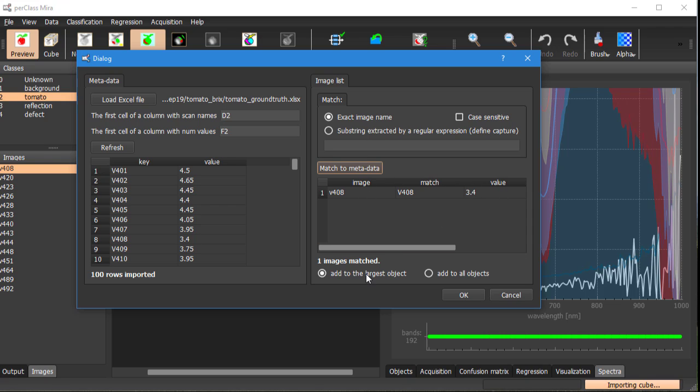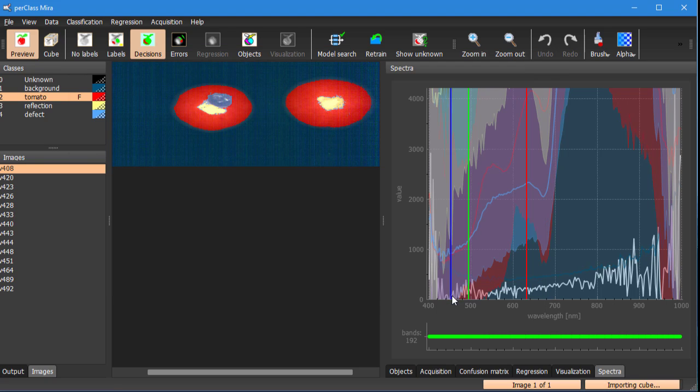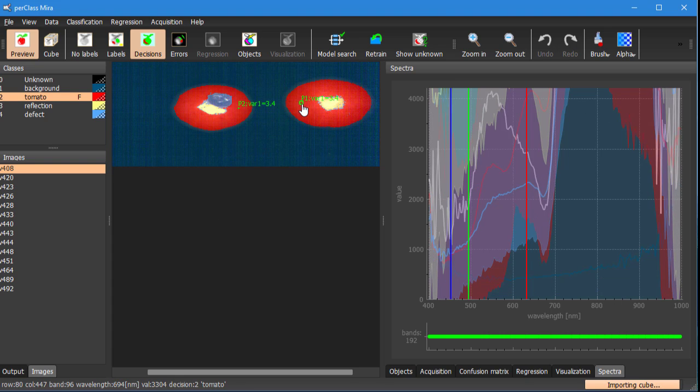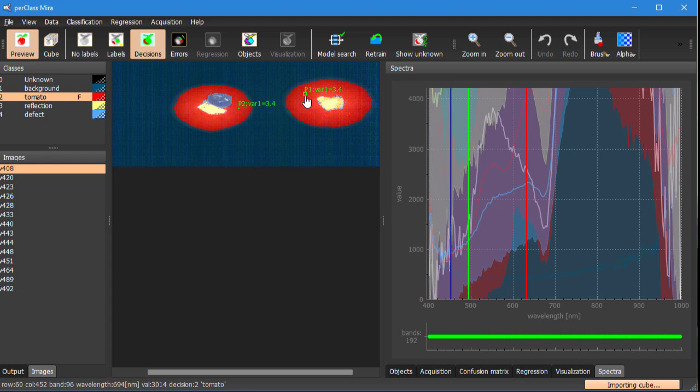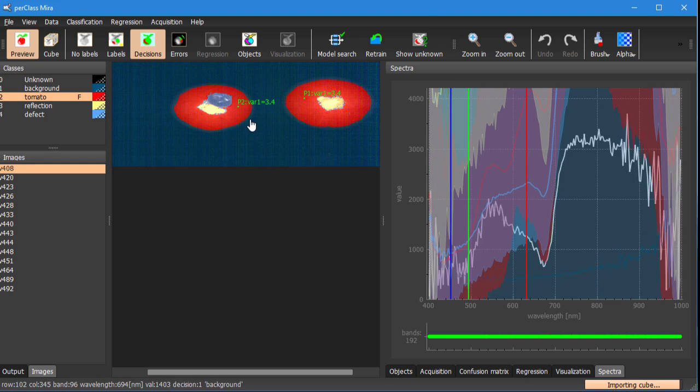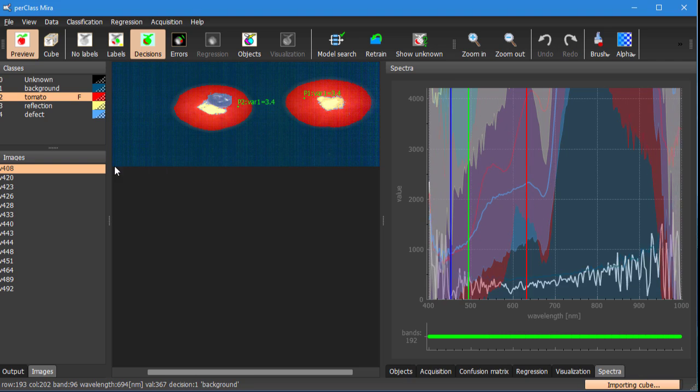Now we can choose how do we attach these values to objects in our image. It can be to the largest one option but in our case we want to attach the numerical values to all objects in each scan. If we click OK we will see numerical values appearing on our objects.